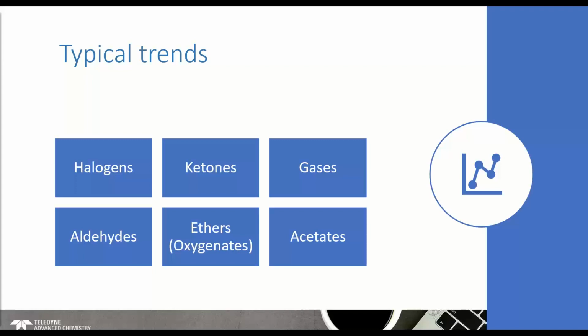Taken from the method, ketones, alcohols, ethers, and other water-soluble compounds will have lower responses. Elevated temperatures may be necessary during purging to exhibit better performance. You will also notice a low response for halogens due to dehalogenation caused by hydrogen.